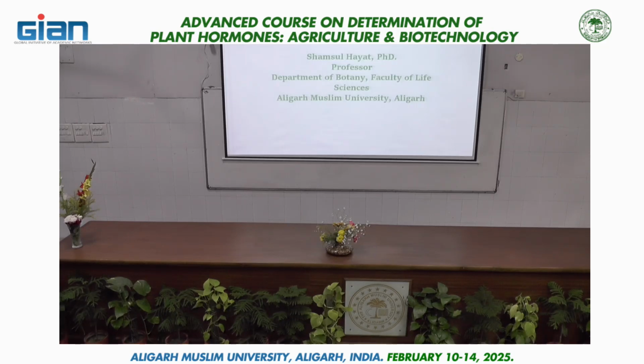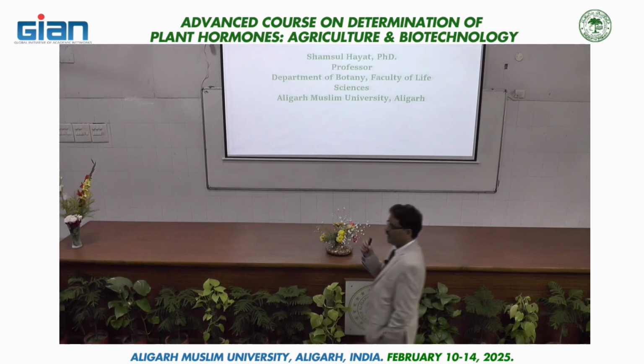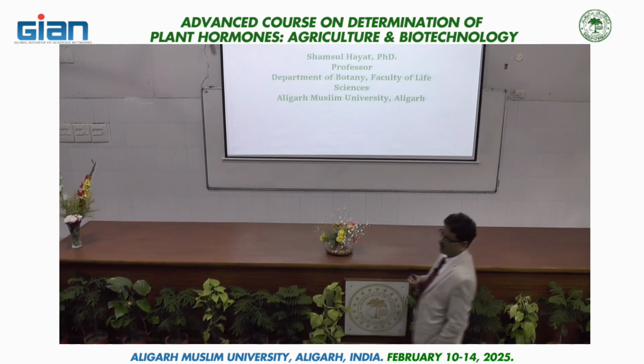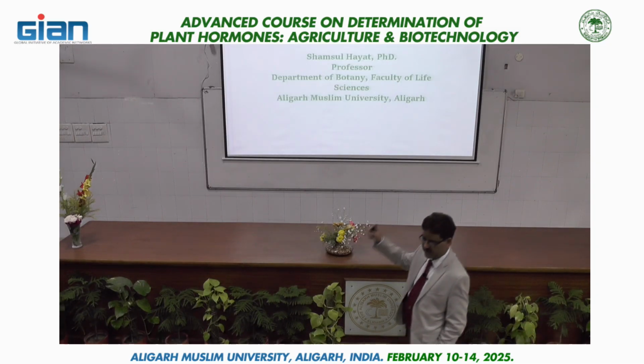By the one tutorial today. So, the tutorial is basically on the methodology related to gas chromatography and mass spectrometry. The basic things, which are the principles related to this particular machine, will be spread here, and after that you will go into the laboratory where you will see how this machine works.